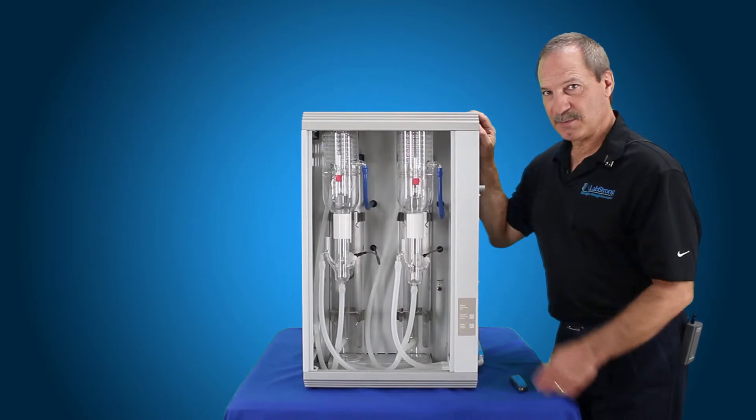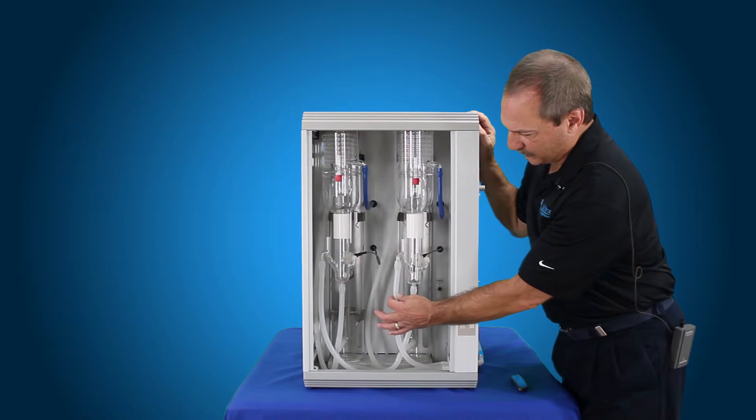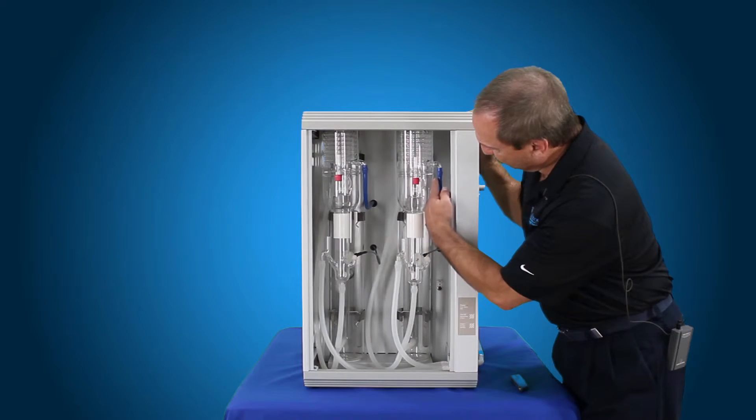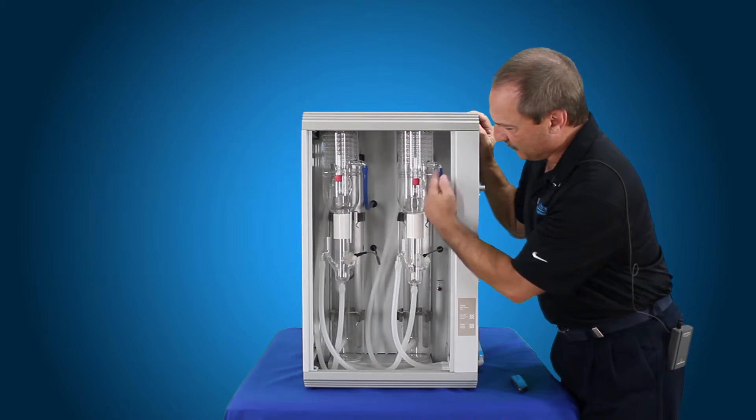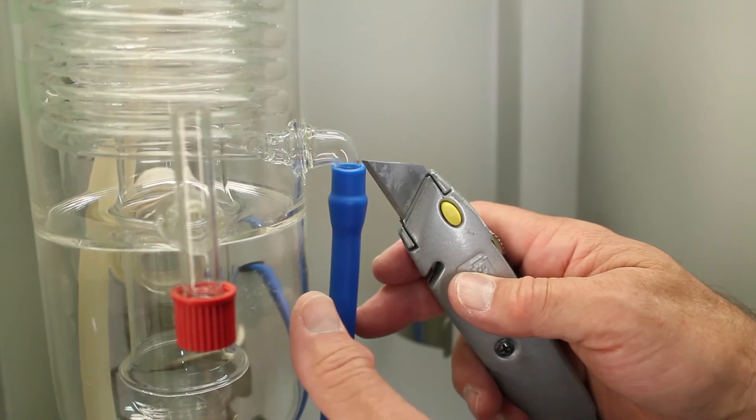Now all the tubing is pretty much the same when you remove it. They're all going to be adhered to the glass, so your overflow for your constant level device, the fill for your constant level device, and the blue tubing for your condenser, that's going to be the same thing. You're just going to take a knife and cut it lengthways.